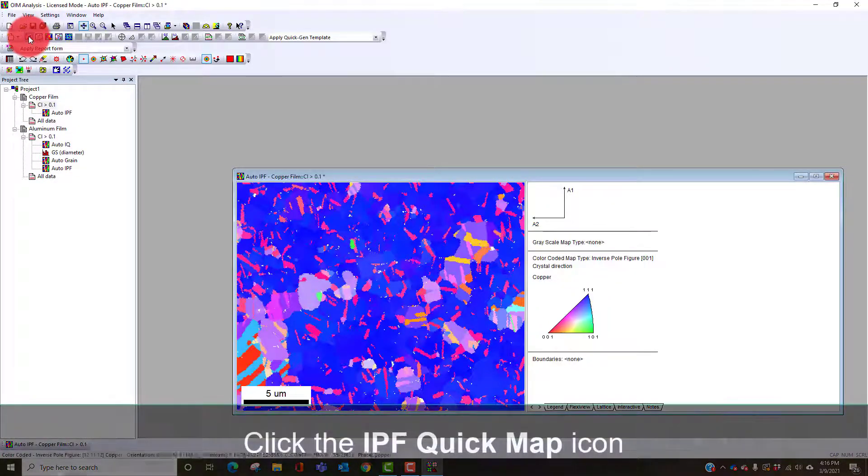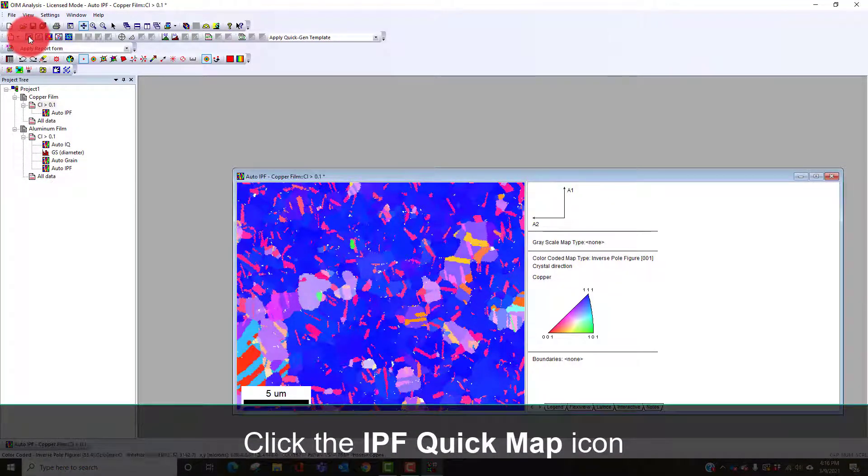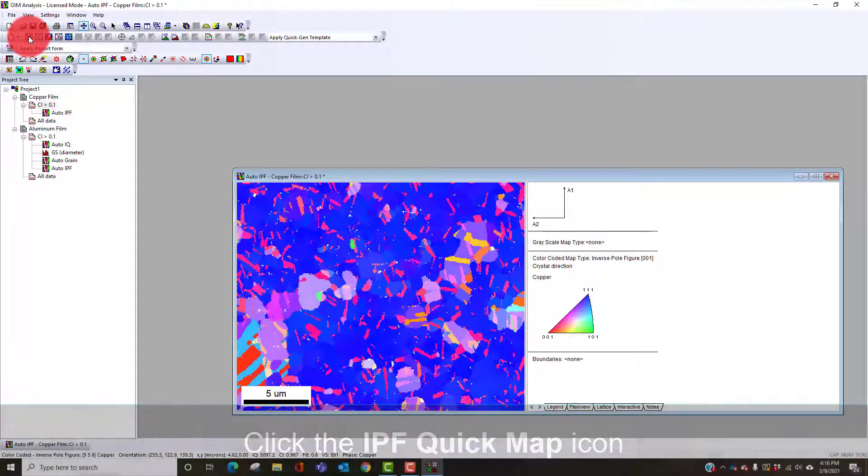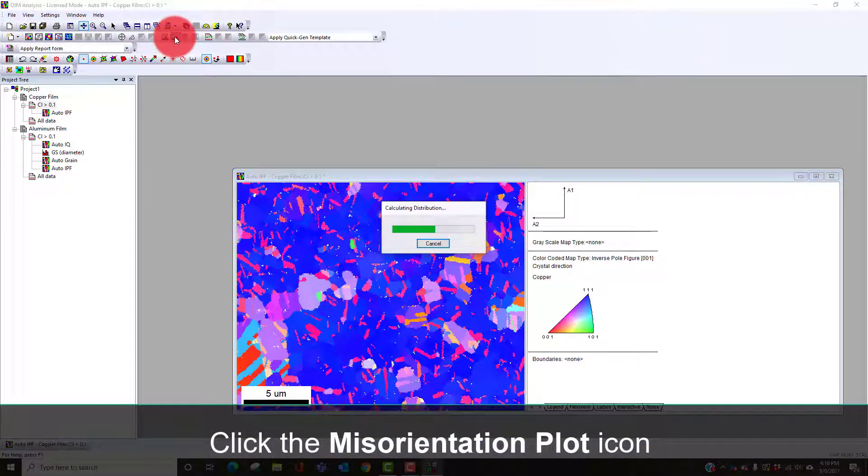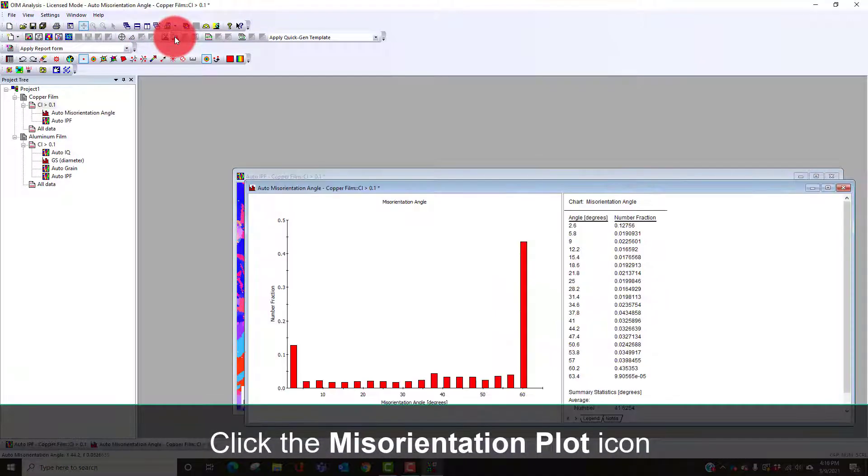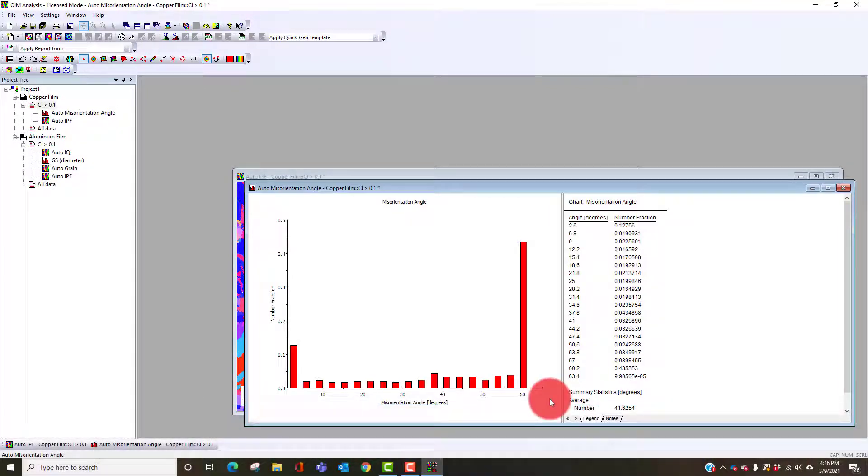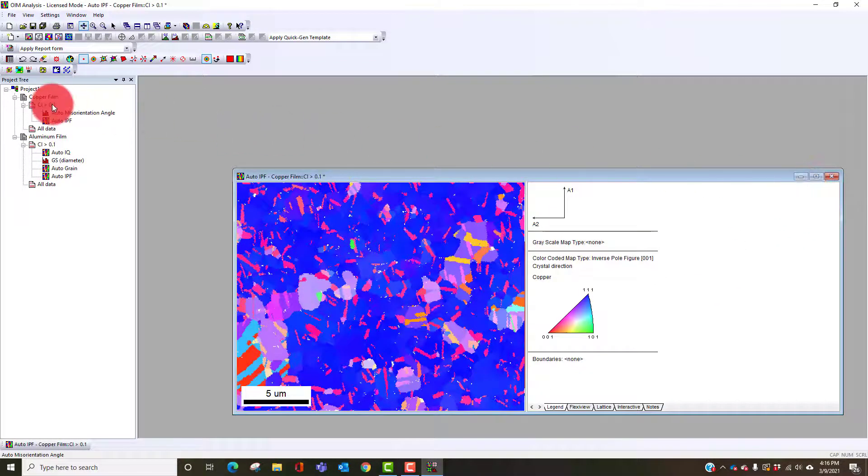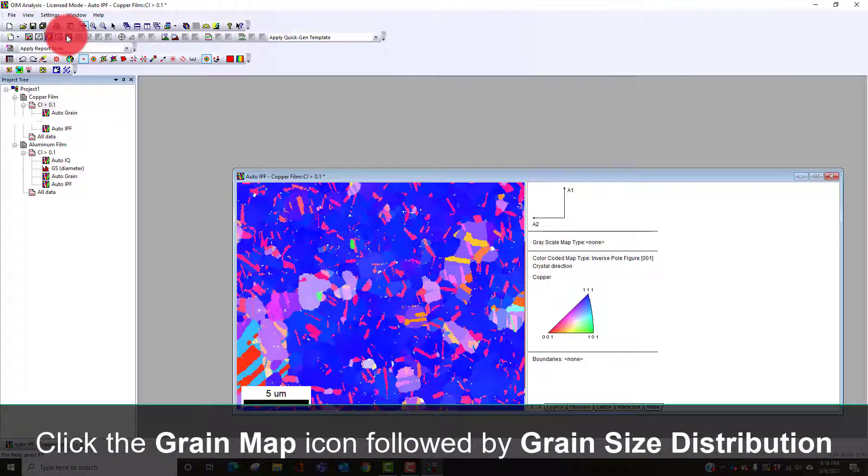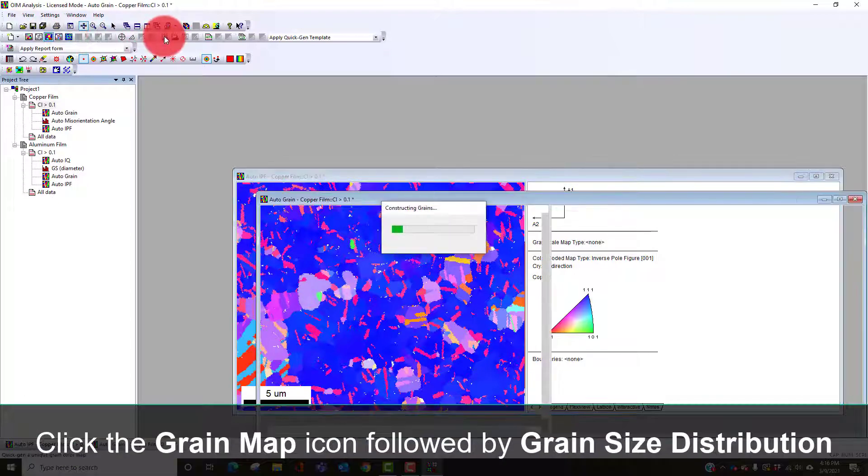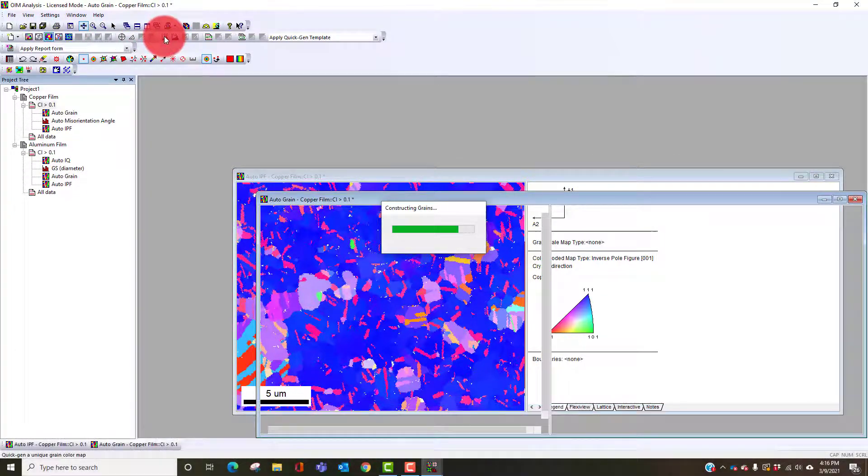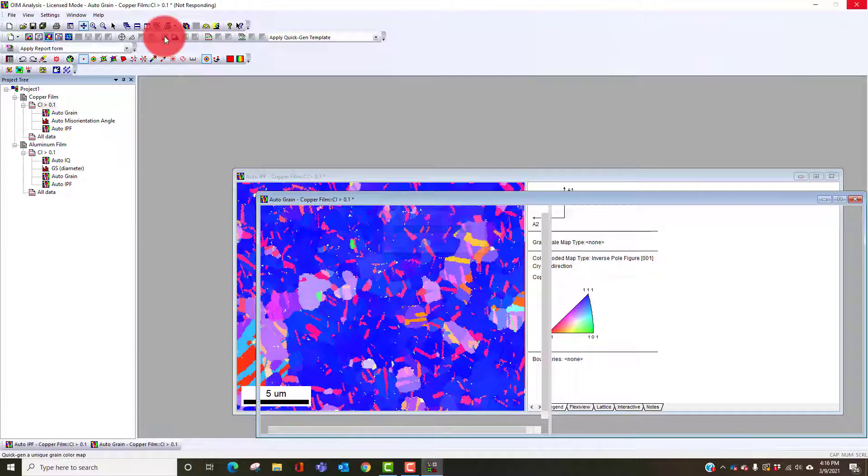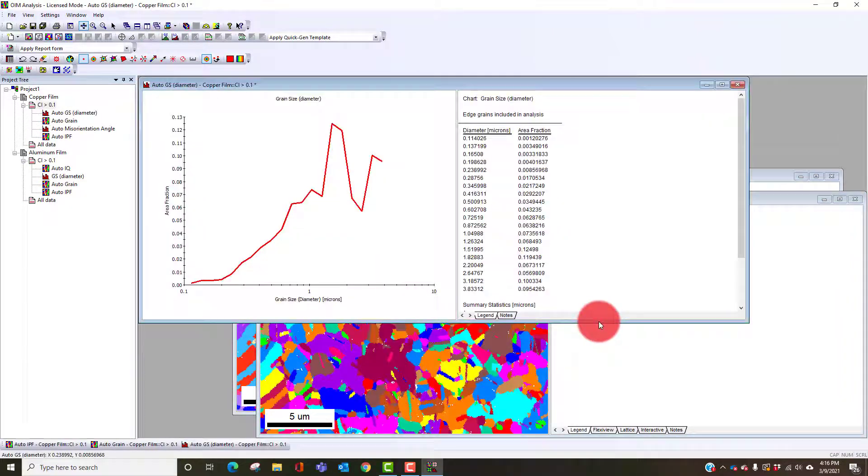We see again a lot of strong one-one texture but a lot of the twin boundaries here. If we look at our misorientation plot we'll see there's a big peak at 60 degree misorientations, which are the twins.